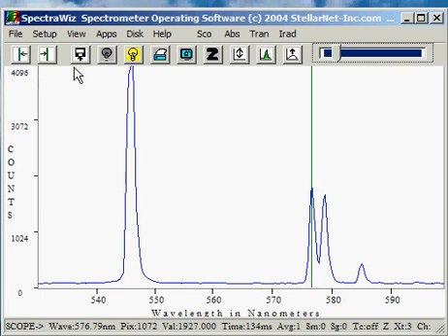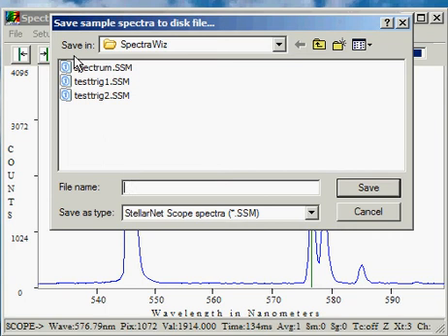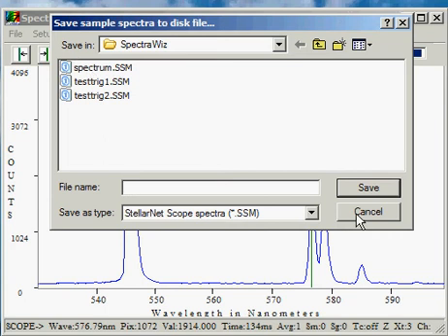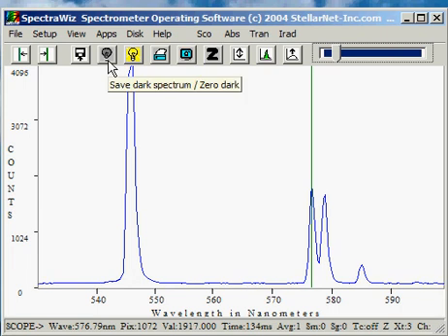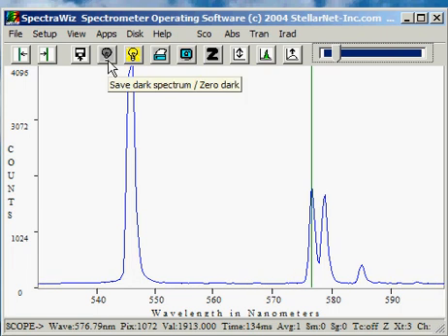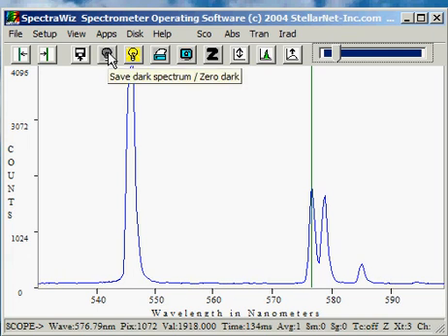The next icon allows you quick access to the file saved. The dark lightbulb is the saved dark spectrum. Or, if you right-click, it'll zero the dark array.